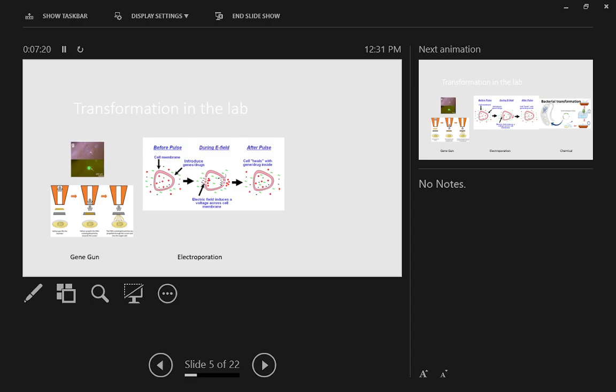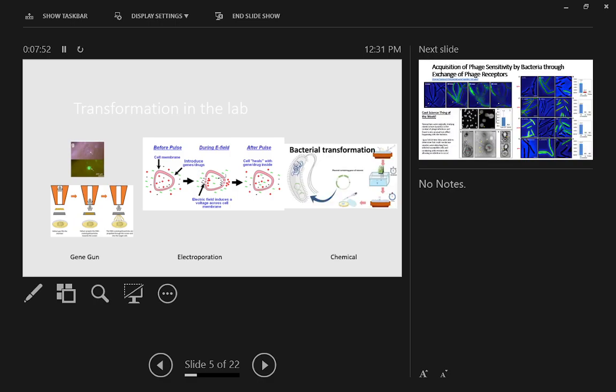It didn't work for all cell types because a lot of them are really finicky about being shocked for long periods of time. And also it doesn't work for a lot of cell types that have very thick protein matrices that get in the way of this. But it does work to an extent. It's really handy. Also, the other downside to this is that it's not the smoothest of all things. So you can actually get leaks a lot. And leaks don't sound like a big problem, except that the voltage for this is super high. So if you touch the leak while the thing's running, you can die, which is bad. So generally speaking, it has a couple of downsides to it.